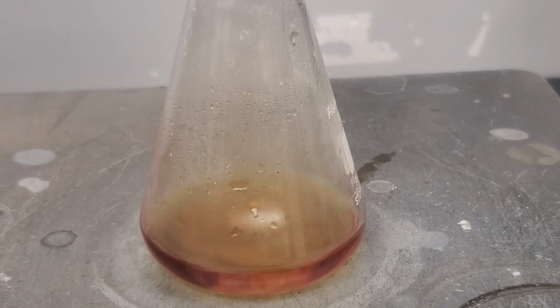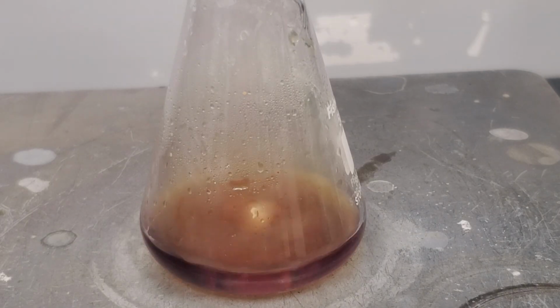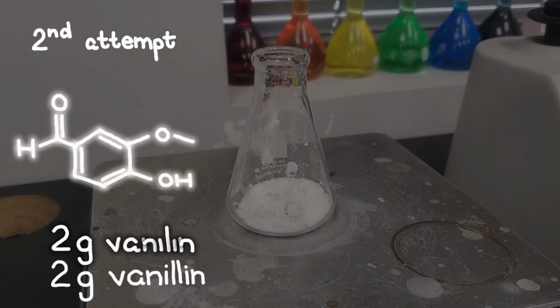I immediately moved everything into the fume hood and let the vapors clear, then poured the reaction mixture into a beaker containing 30 ml of cold water to crash out the product. For my second attempt, I changed the solvent system.